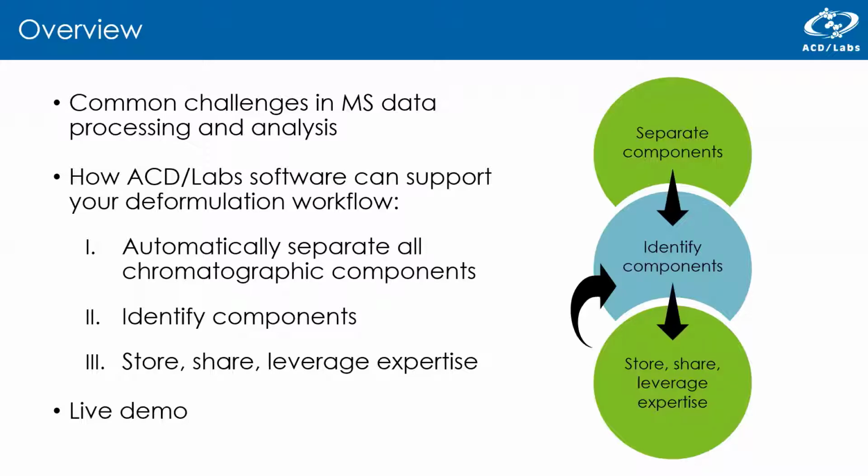So once we've gone through these steps, we are going to switch over to the software, and Anne-Marie will give us a live demonstration of how our tools can be used.